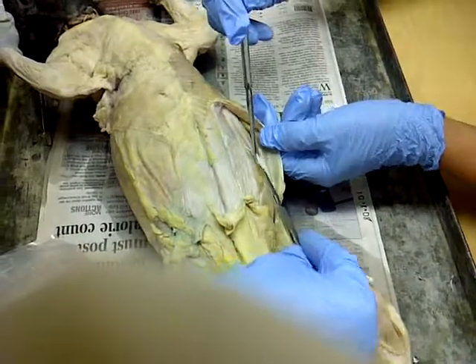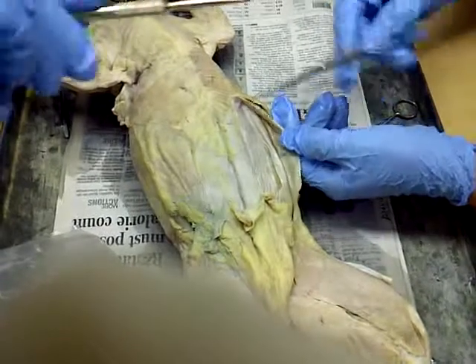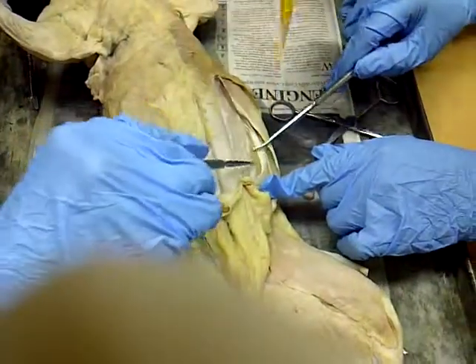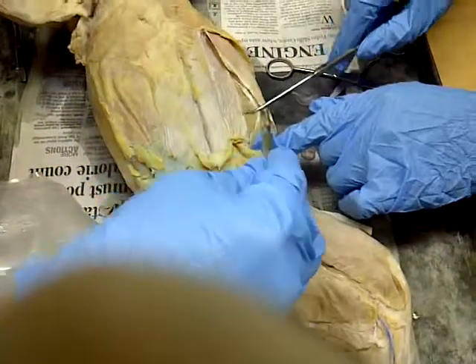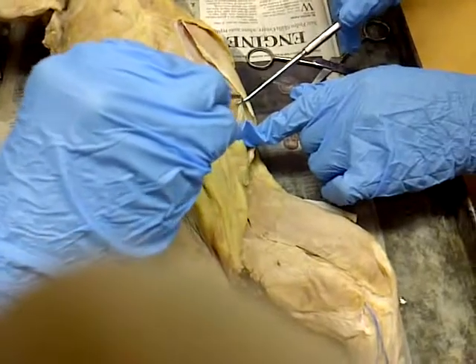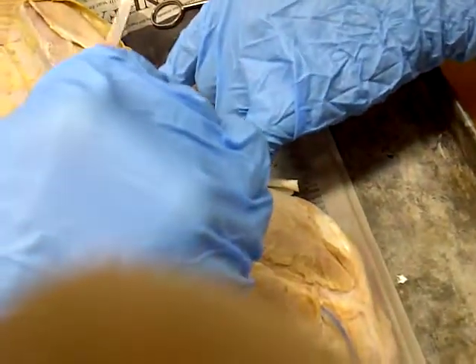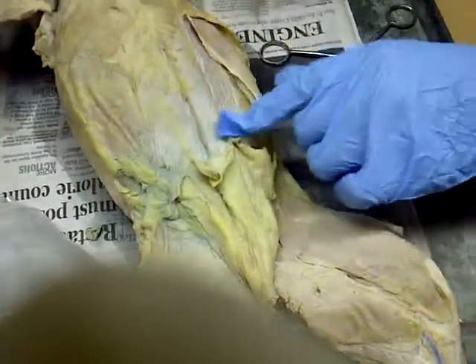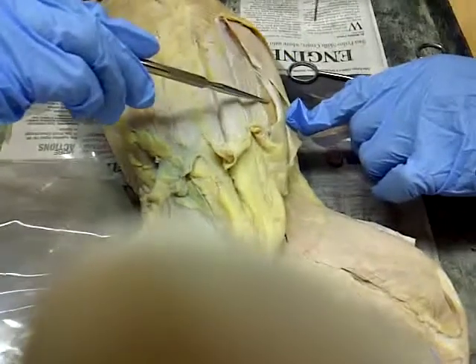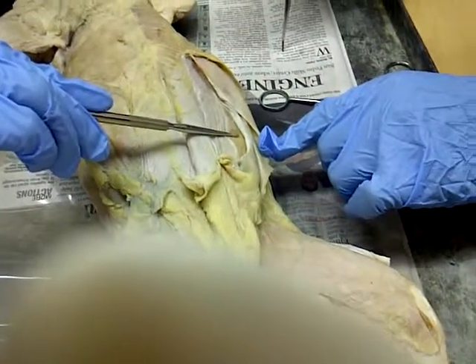And then inside here, where the fibers are going this way, they're transverse. That is the transverse abdominis. See this section right here where the hair is not supposed to be? See how the fibers go this way? That's the transverse abdominis.